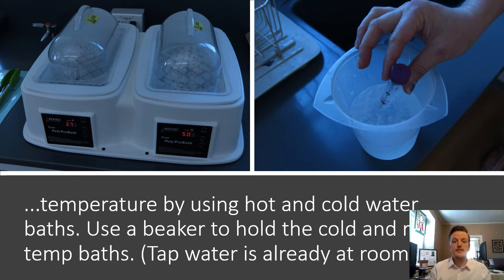And so in this case, the way that we're changing the temperature is through the ice water baths and the hot water baths. And you'll be using tap water as the room temperature bath just to make sure that your conditions are similar across your treatments.